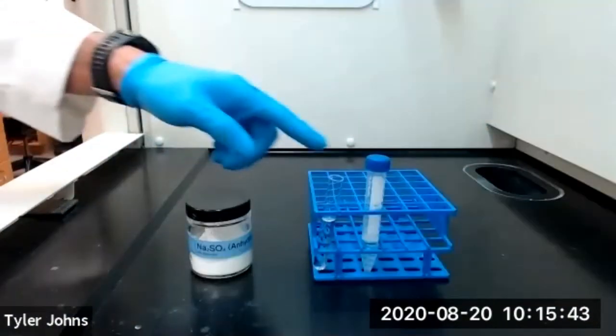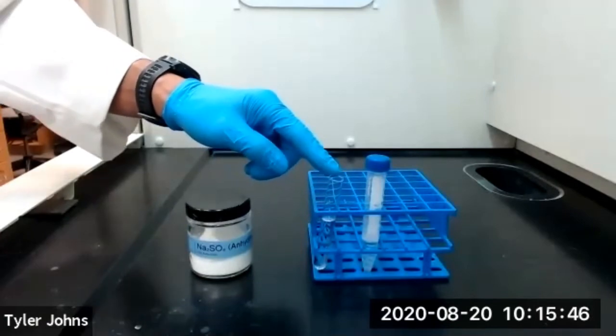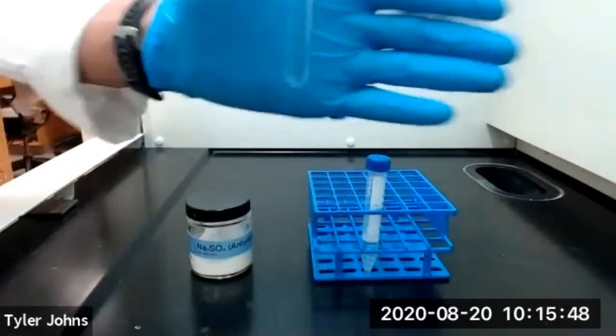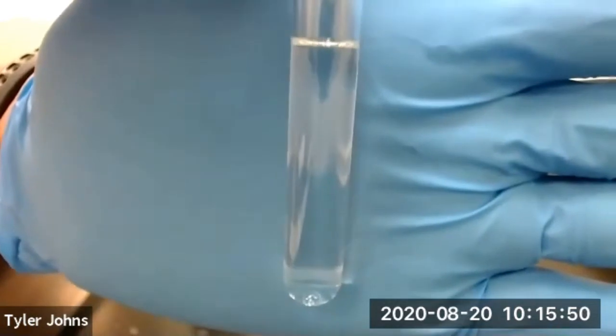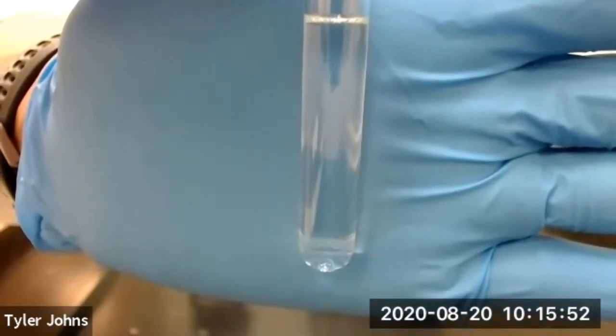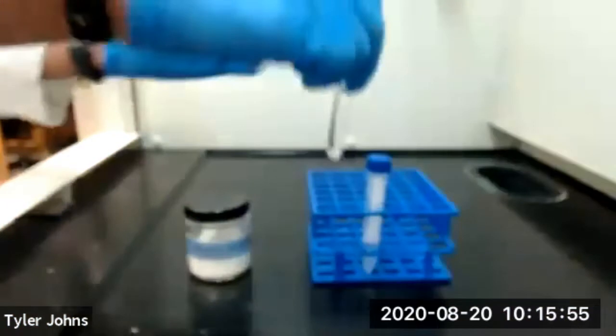We've collected our three two-milliliter extractions of methylene chloride in a test tube. You can see now that we just have one layer, which is our organic layer of methylene chloride in our test tube.